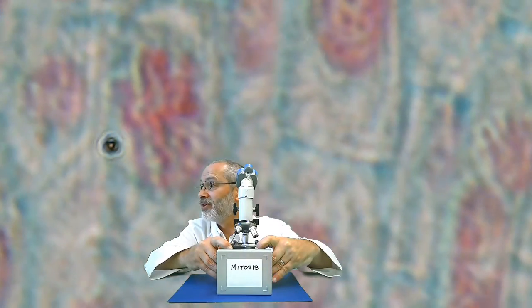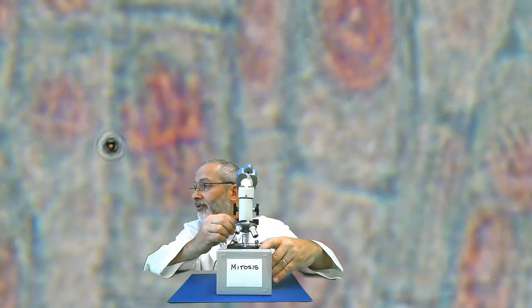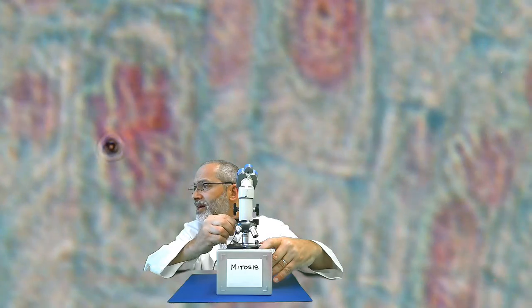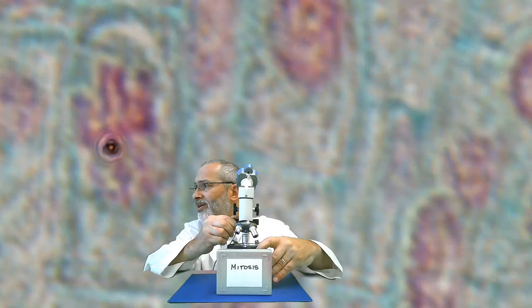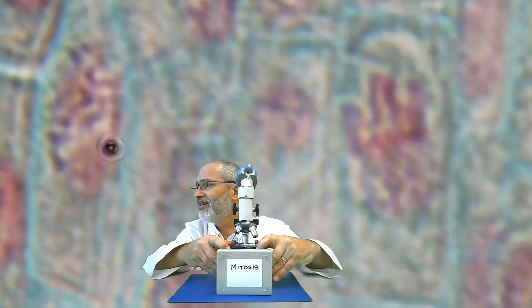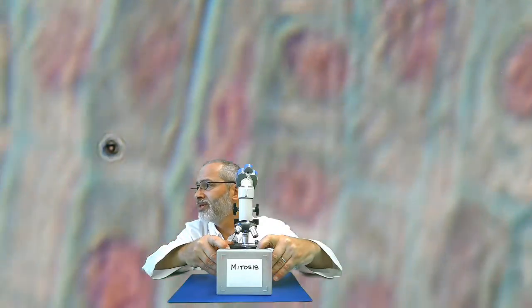Here's another one by the smudge here. You know, that smudge makes a pretty good pointer for our purposes here. But notice these squiggly lines, which are the chromosomes, we can tell that they are doing something different here than, say, in a cell nearby, like here or here, where the smudge is.